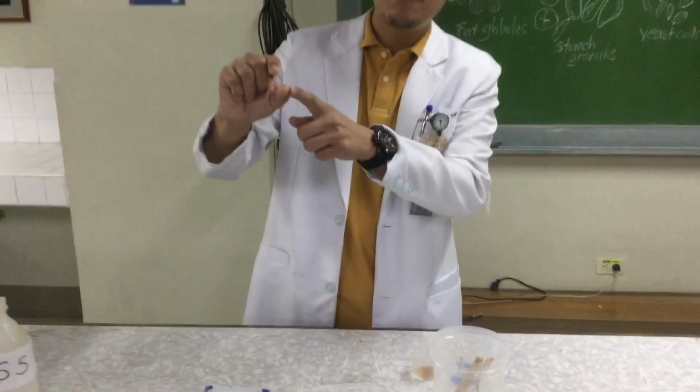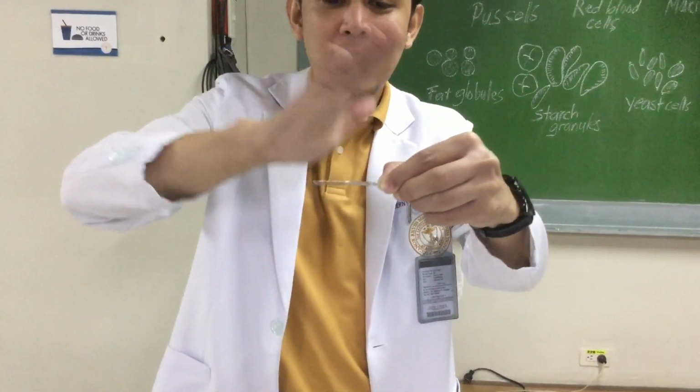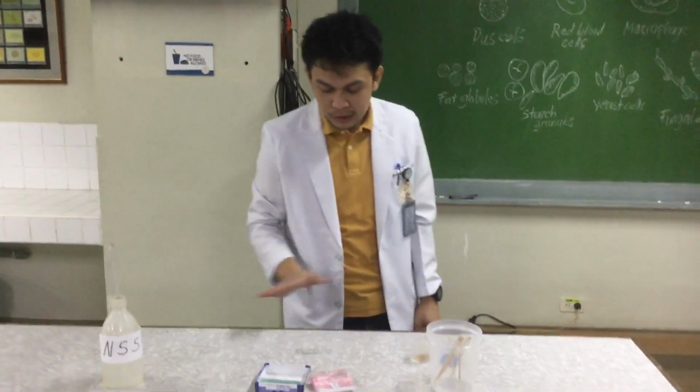Between your thumb and your index finger, allow the other side to touch the mixture, and then slowly lay the cover slip flat, and then allow it to stand for about 1 to 2 minutes. Okay? For about 1 to 2 minutes para lang masettle yung particles dyan.